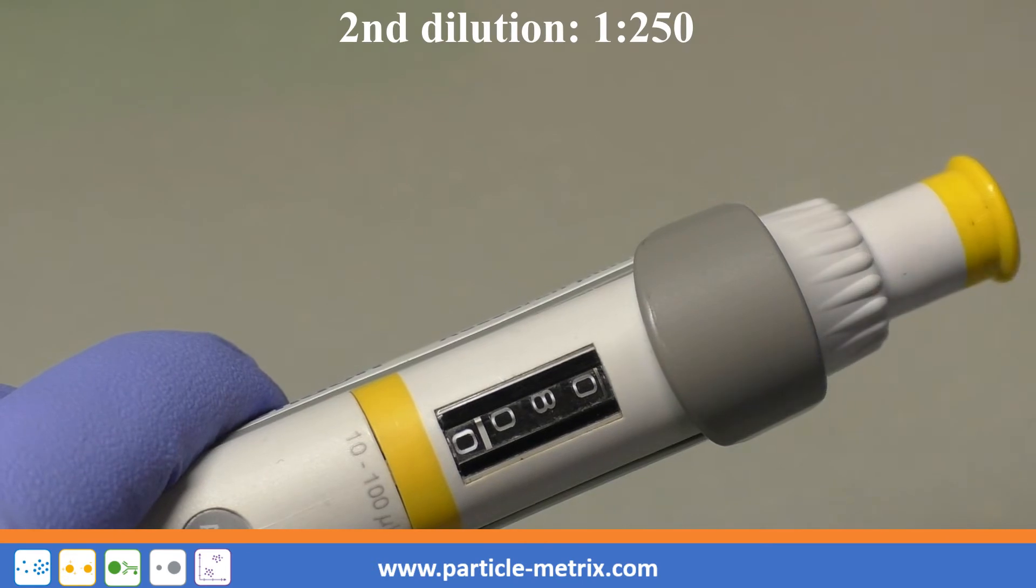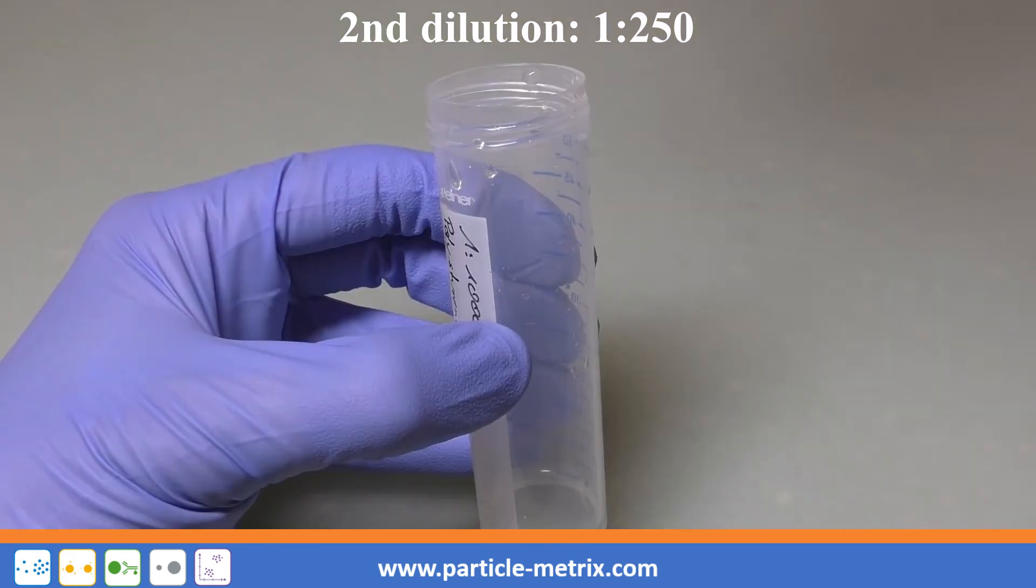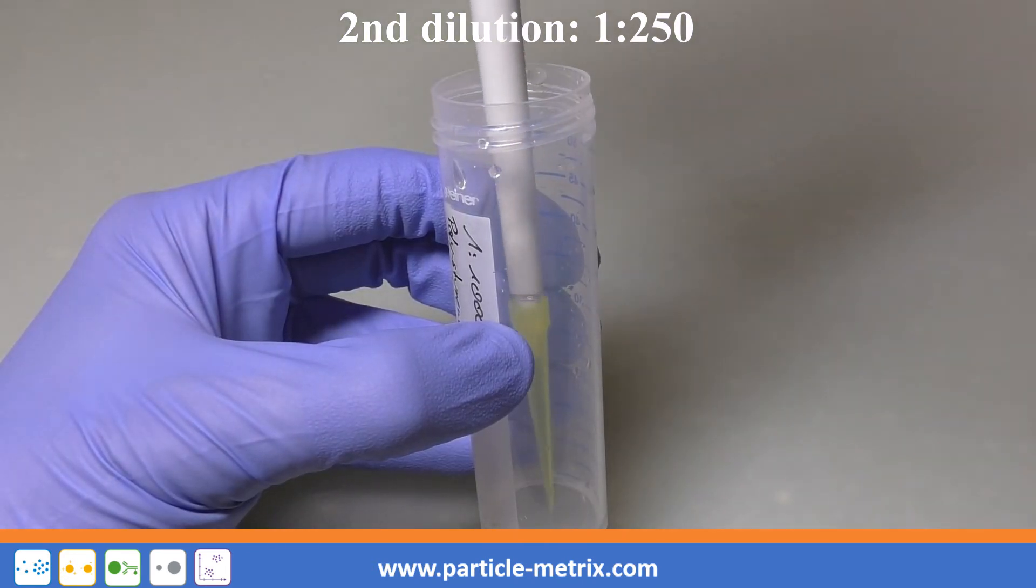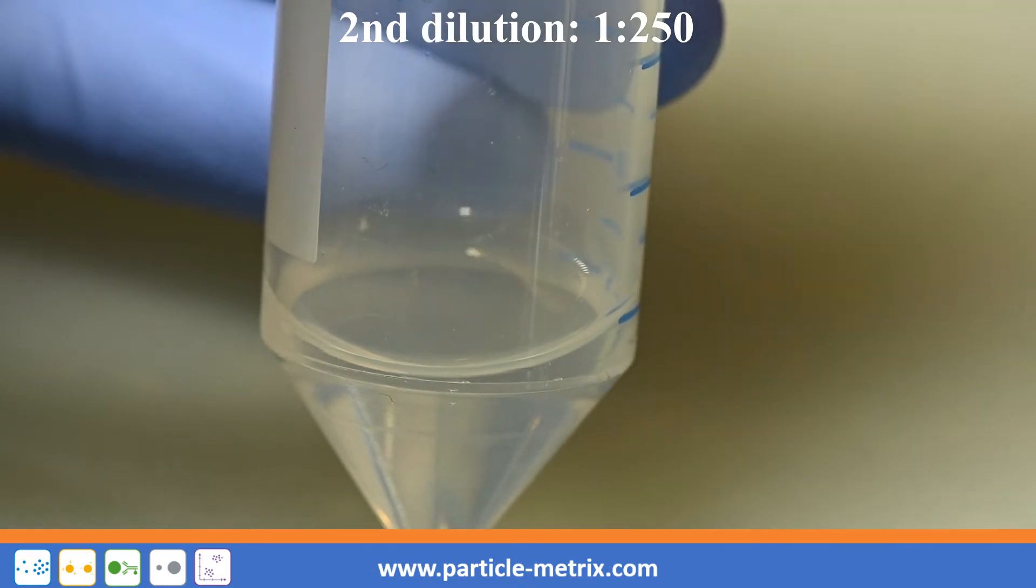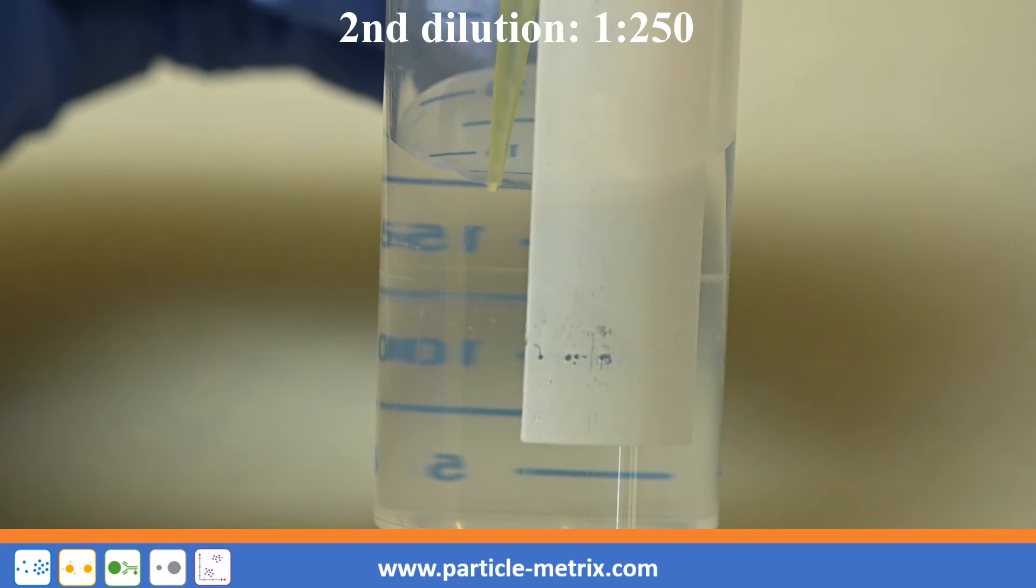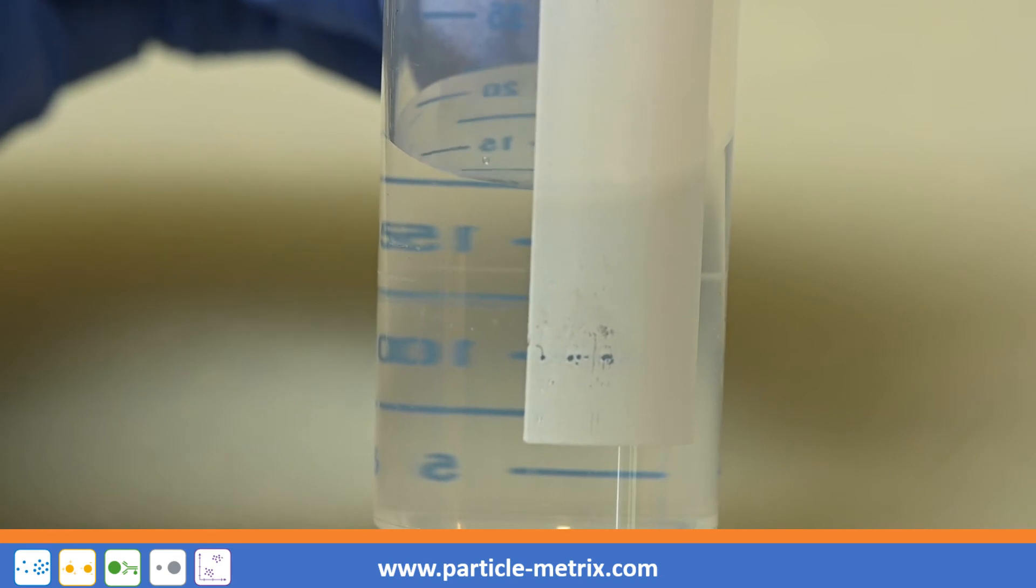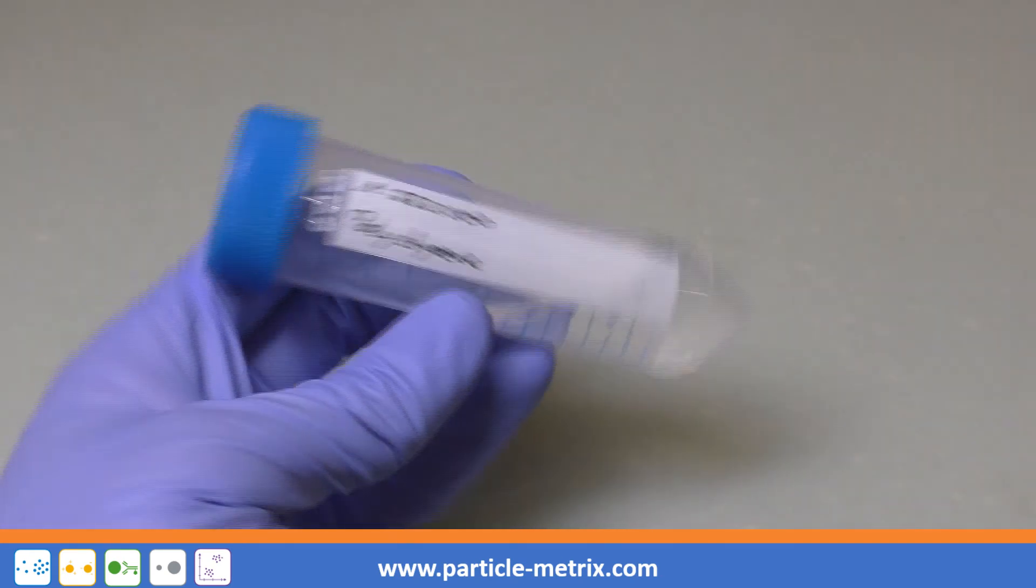In the second dilution step, pipette 80 µL from the 1 in 1000 dilution from the first step into 20 ml of particle-free water. This results in a final dilution of 1 in 250,000. Again, scale up or down according to your requirements.